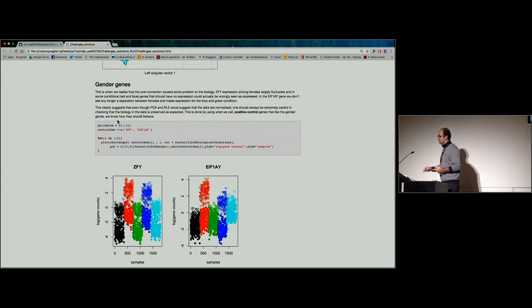If you go to the raw data set, is there a question here? So can you always use those gender genes to see if your data is properly adjusted? It depends, because it's a targeted panel, it's not genome-wide. In fact, you've got only 250 genes for this set. These people were quite smart: they added these gender genes for controlling some part of the experiment.